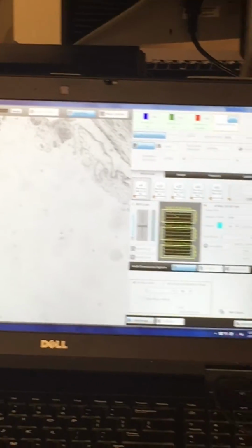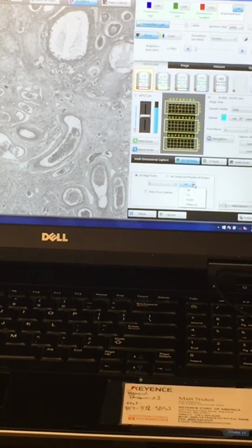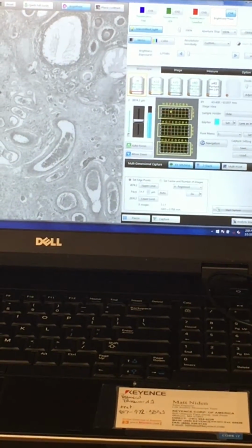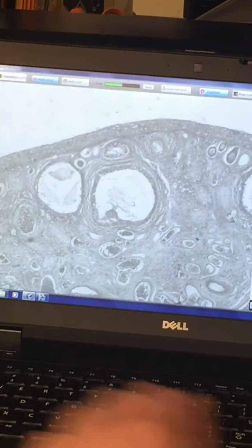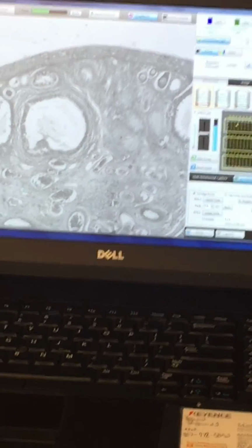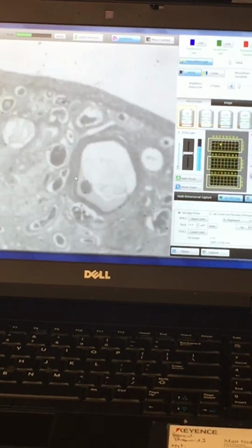You can also, I'll do a really small one right here. So you can combine stitching and Z-stack as well. So basically what you do is at each point, so let's say I want to set this as my A point, right? I'm going to scroll up, set an upper limit, scroll back down, set a lower limit, and then I'm going to move coordinates.